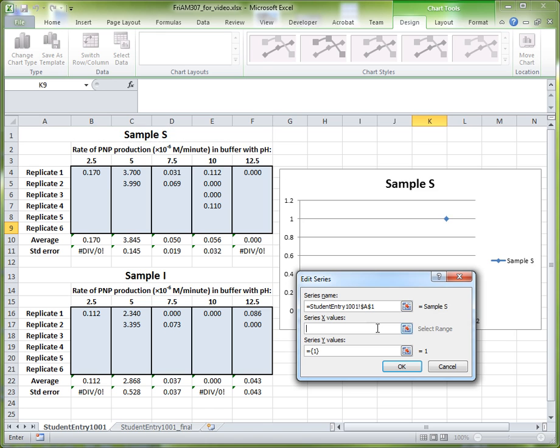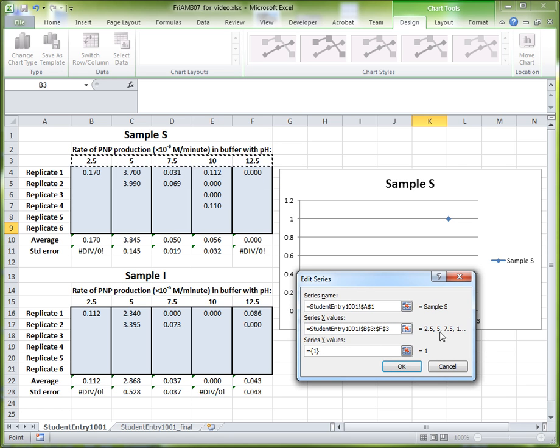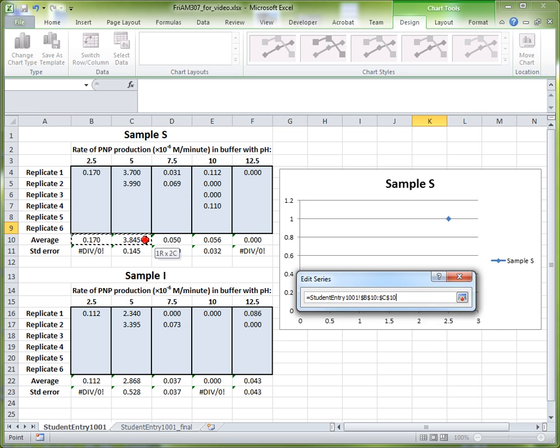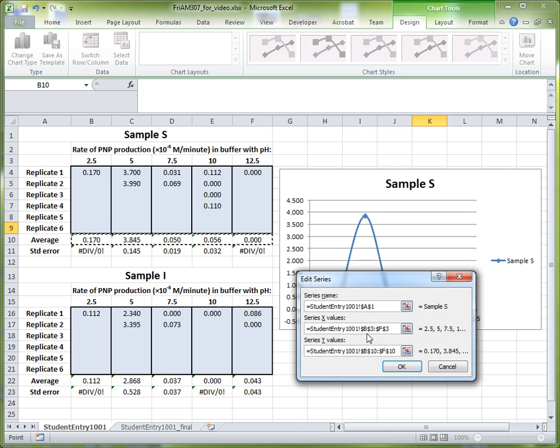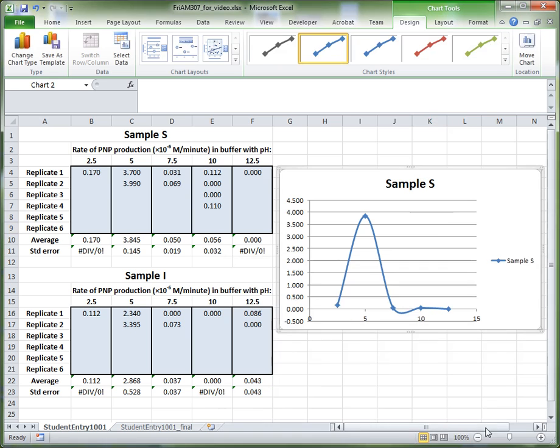The next step is to put in the X values, and the X values here would be pH: 2.5, 5, 7.5, 10, and 12.5. Click into the X values box, then highlight these five cells to select the X values. Next, specify the Y values — the Y values will be the average activities, or average rates of PNP production, at each of these pHs. Highlight those values and click OK. If we get out of this dialog, we can see that sample S has been nicely plotted onto the graph.